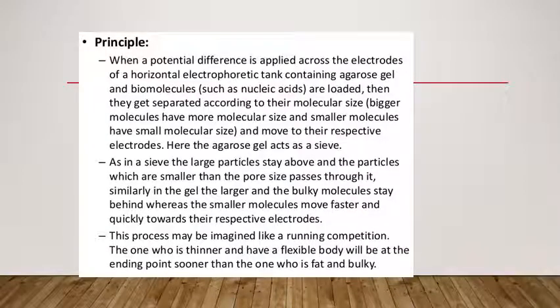The gel electrophoresis principle: the gel means a matrix which is used to contain and to separate out the target molecules. In most cases, the gel is a cross-linked polymer whose composition and porosity are chosen based on the specific weight and composition of the target molecules.